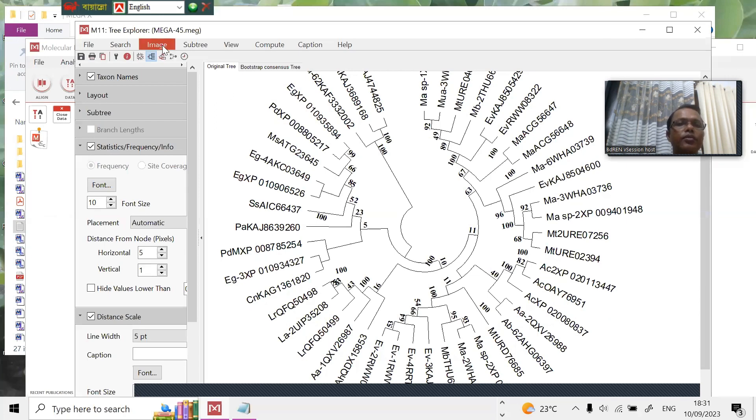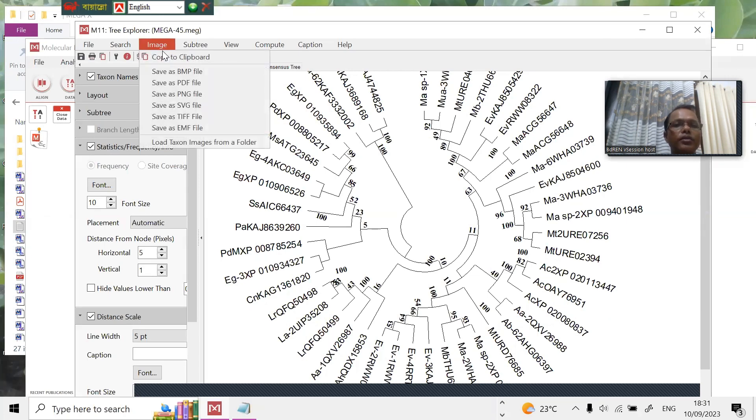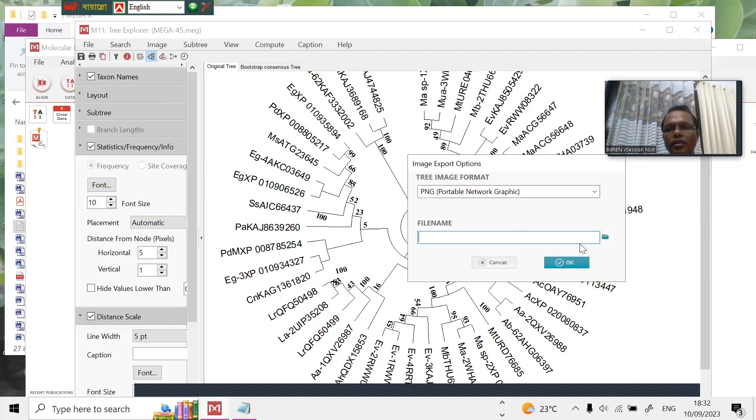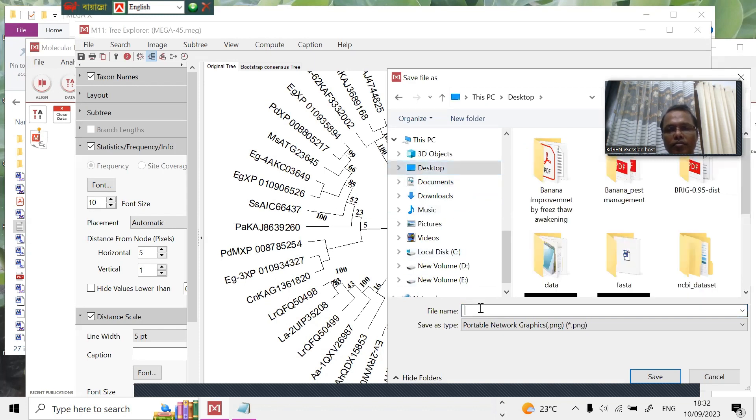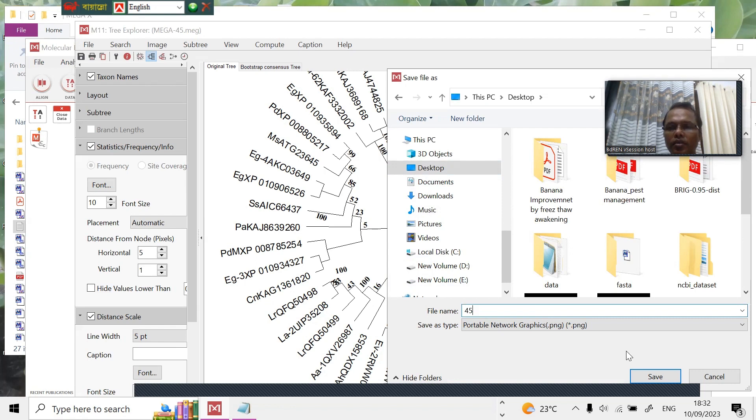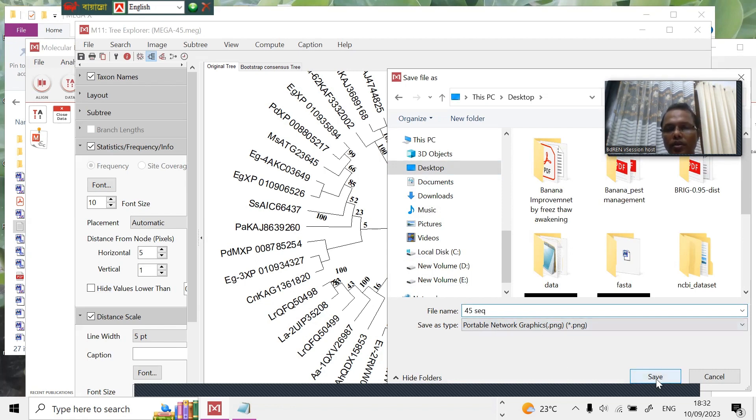From here you can see image, save as PNG file. You can save it, say to the desktop. File name, 45 sequences. By this way we can finish.